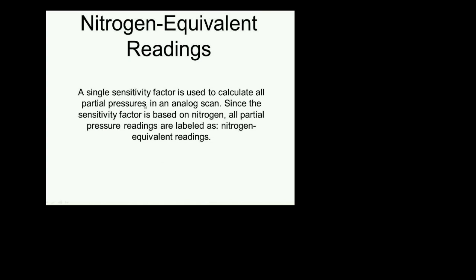So that's what I say here. A single sensitivity factor is used to calculate all partial pressures in analog scans. The sensitivity factor is based on nitrogen. All partial pressure readings must be labeled as nitrogen equivalent readings.